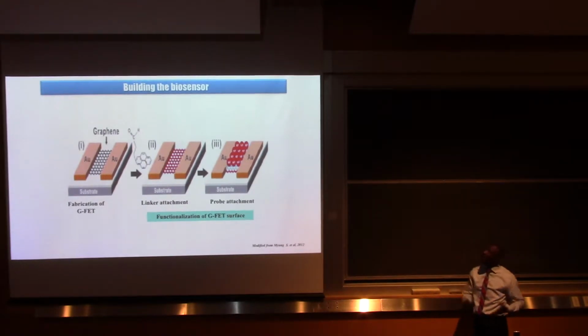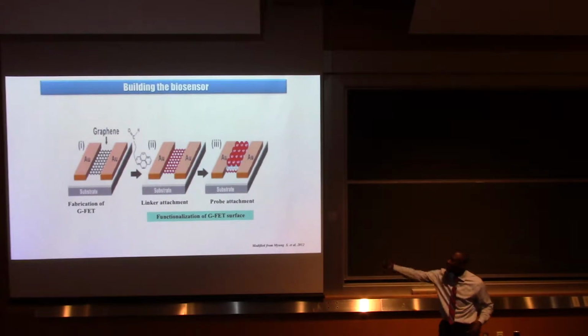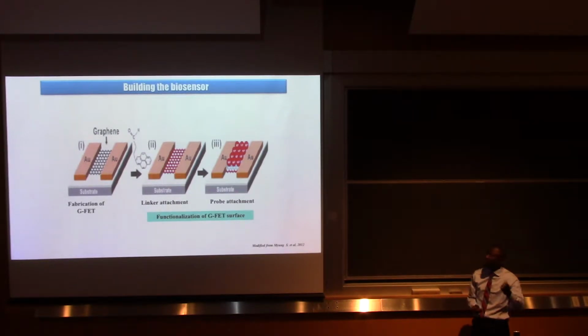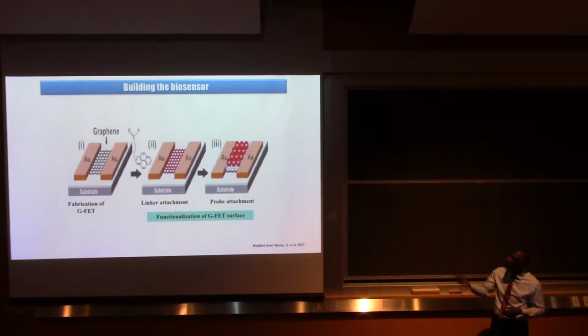So in building our biosensor, we have two main procedures: the fabrication and the functionalization. The fabrication will be explained more by Ms. Nadia. My work in this project is to functionalize this biosensor device.